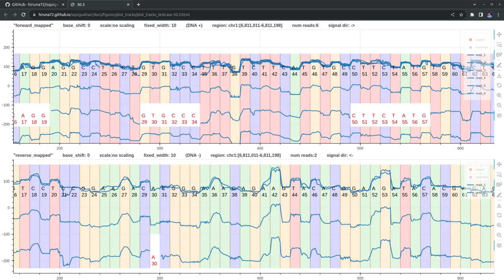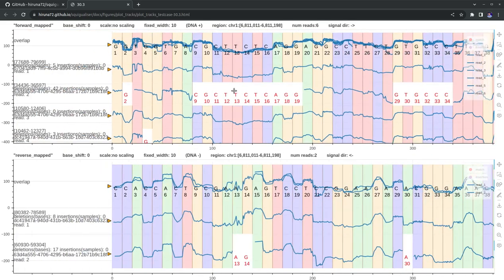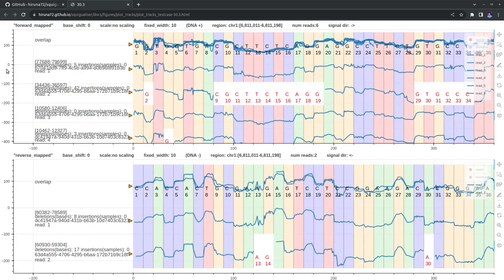If the overlap has a clean, very sharp structure like this, it says 2 things. The first one is the alignment tool that you use to align these signals is really good, and the signals themselves are really clean. If I go to the left side of the plot, you can see some details appear here.